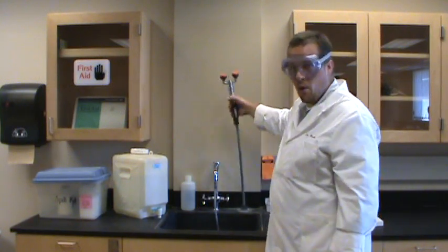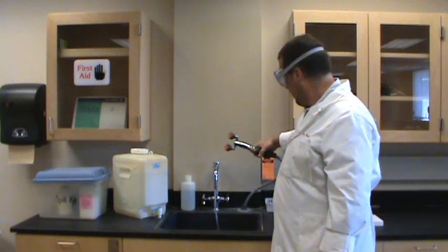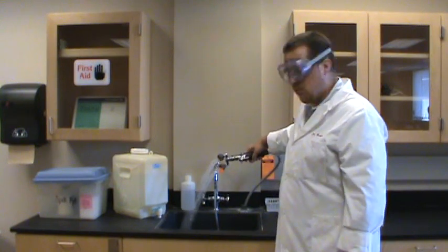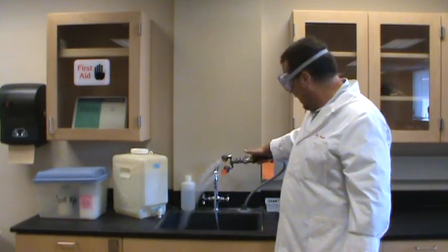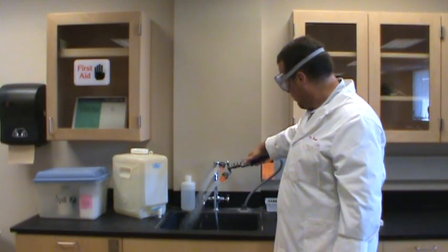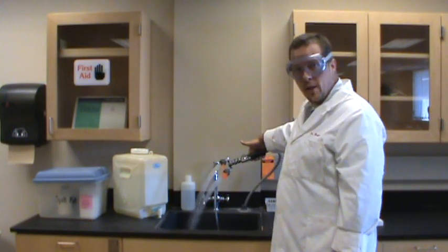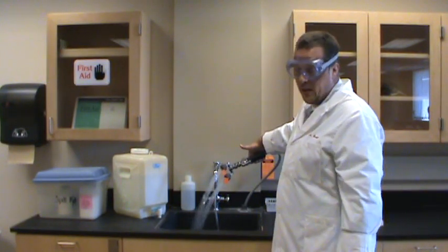There's also an eyewash station beside each of the sinks. These are on a hose so they can be pulled out and squeeze the handle, water will come out. If you want to lock that handle in place, there's a little ring there that locks it kind of like a garden hose.